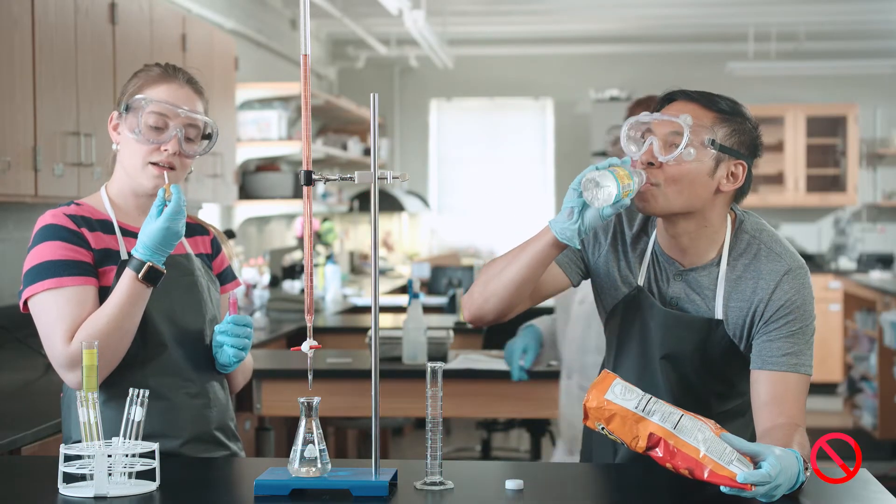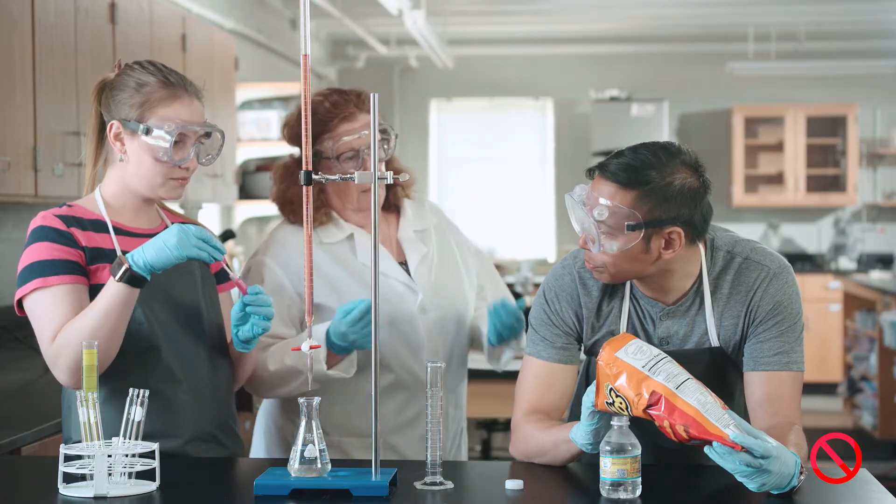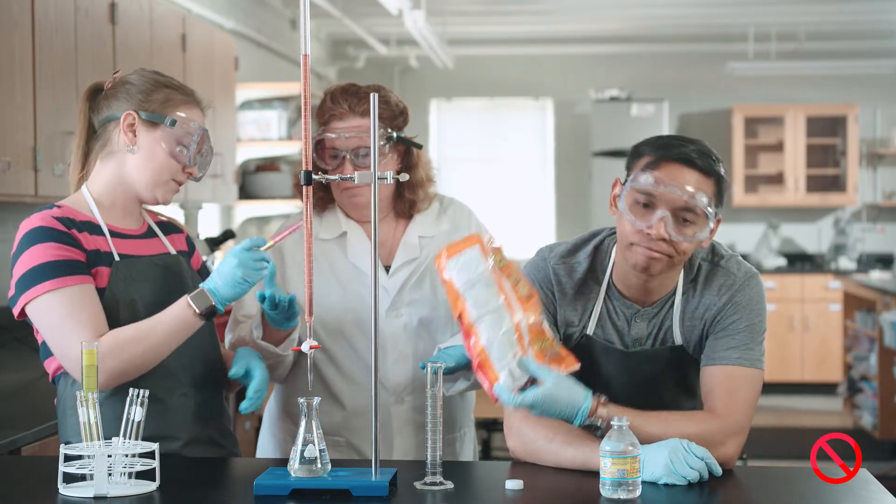Do not eat, drink, apply cosmetics, manipulate contact lenses, or chew gum in the lab.